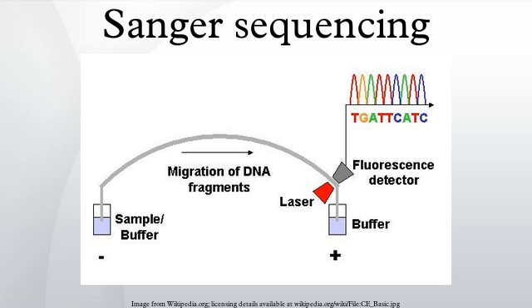The dye-terminator sequencing method, along with automated high-throughput DNA sequence analysis, is now being used for the vast majority of sequencing projects. Automation and sample preparation. Automated DNA sequencing instruments can sequence up to 384 DNA samples in a single batch and up to 24 runs a day.